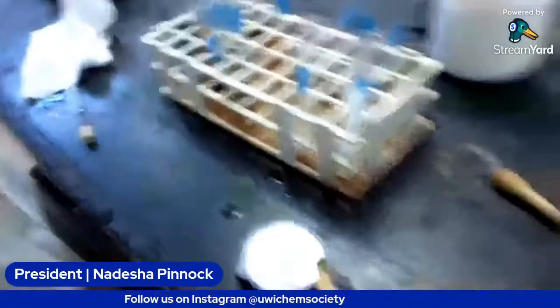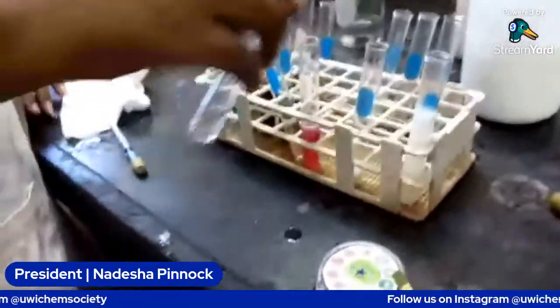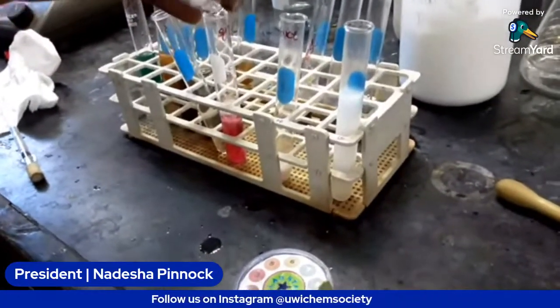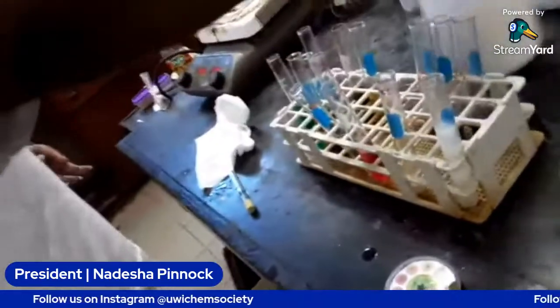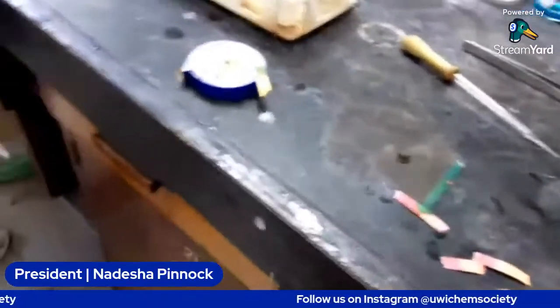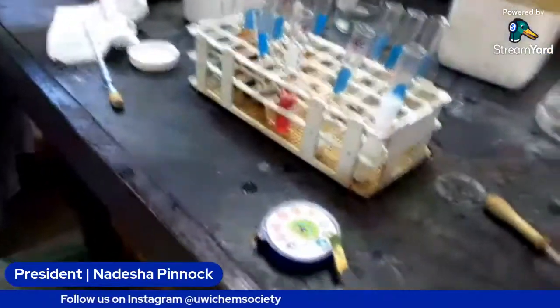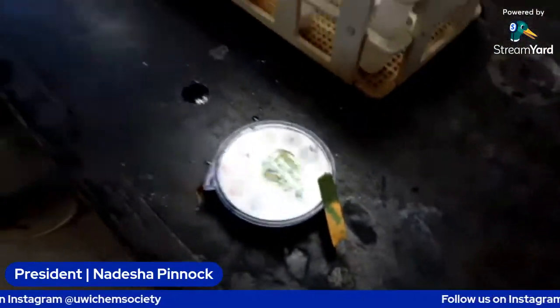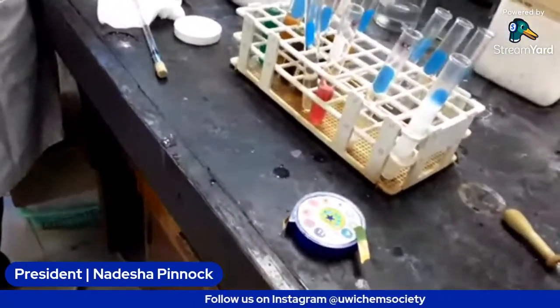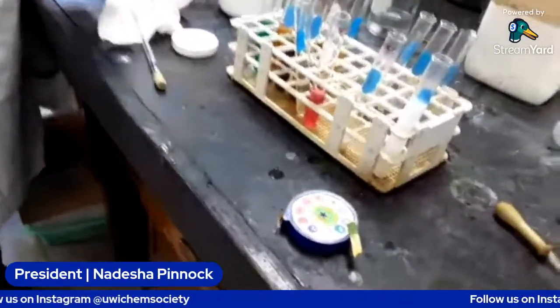Nice. So we're going to go to questions in the meantime while we're doing this, because the thing just keeps on fizzing. By the time we're done, we should have the results in order. Once we neutralize this, we test the pH to see that it's slightly alkaline, then we add our 2 or 3 mL of Benedict's, put it in the water bath for 5 minutes, and then we're good to go.